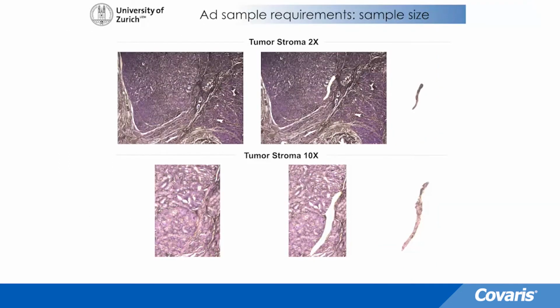Here I would like to take the opportunity to say a few words about the sample requirements for our workflow. Sample size often seems like the obvious limiting factor, but this example of adenomas demonstrates that it is possible to get good data out of tiny tissue pieces.